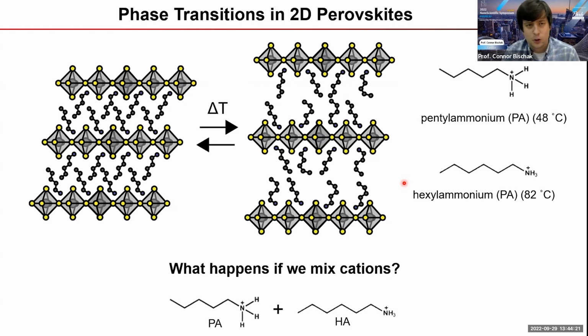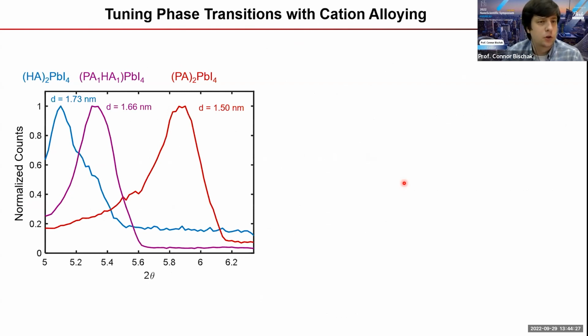So the first question is, do these actually mix? And so we can do X-ray diffraction to show that they do. And so we essentially see this is our pure hexylammonium. This is our pure pentylammonium.